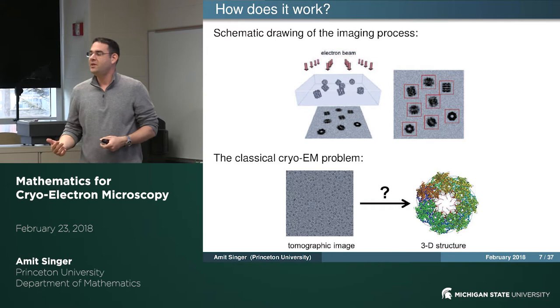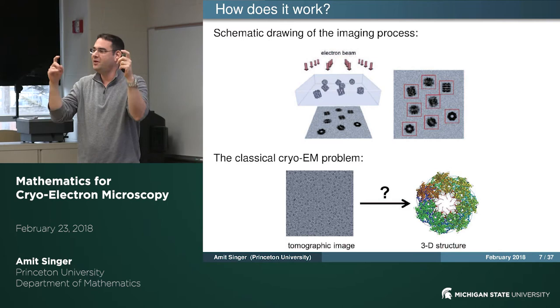But it's a tomographic projection, it's an integral, it's not like an image that you take using your iPhone, let's say. It's a completely different optics.